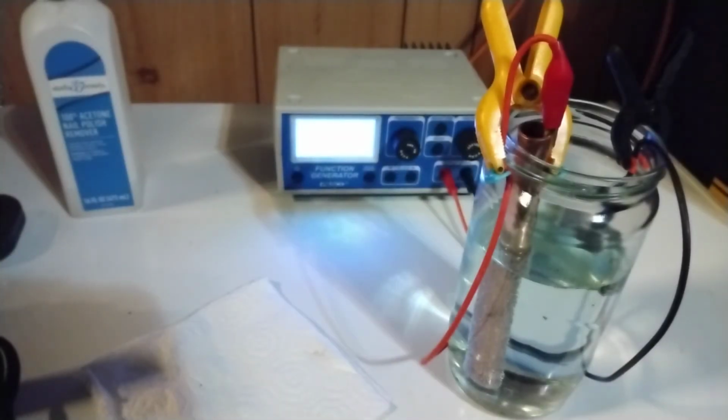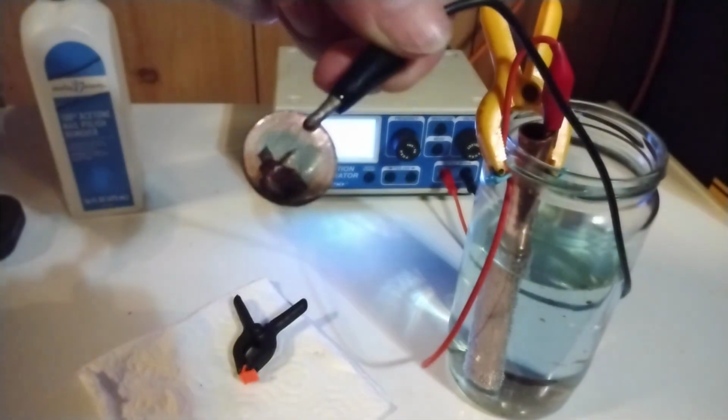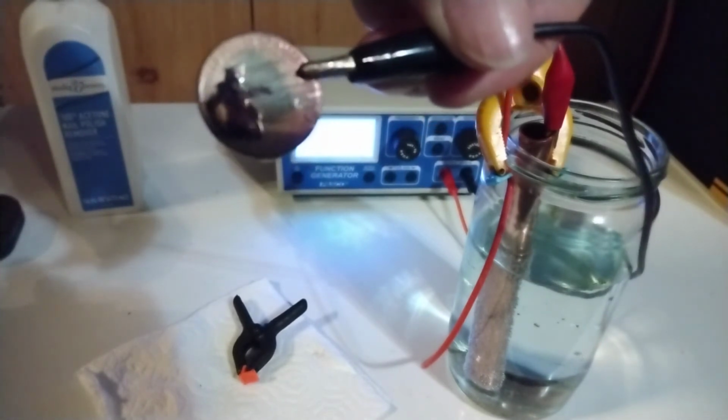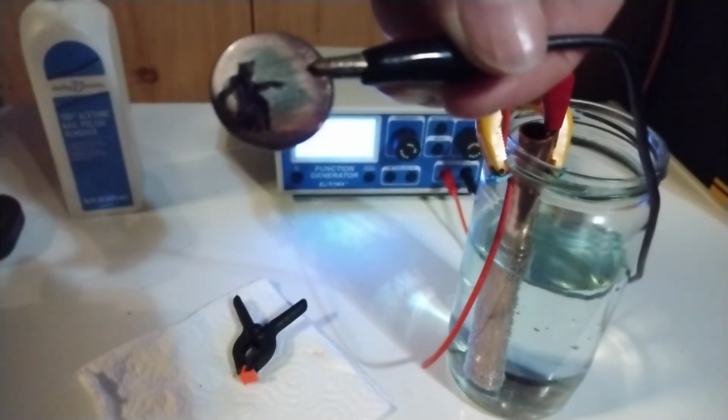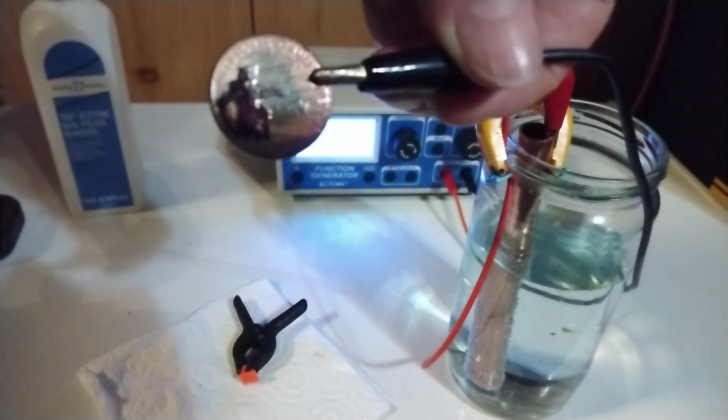Alright, so it has been about 15 minutes and I increased the current to 40 milliamps because the plating is actually pretty slow, much slower than usual. So maybe my electrolyte wasn't concentrated enough. But well, let's see the result. The copper has been deposited on the outside, but not on the area that was actually brushed with the brass. So I don't know why the copper doesn't stick to the brass actually.